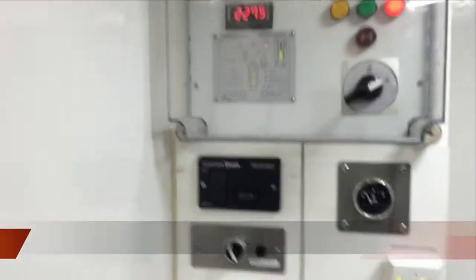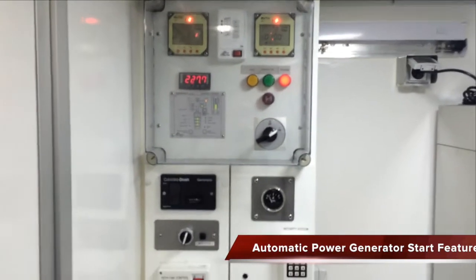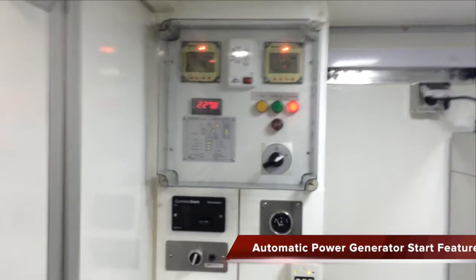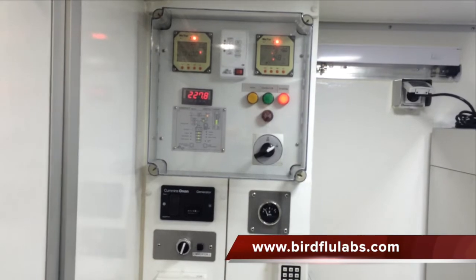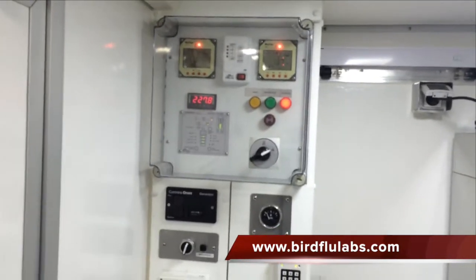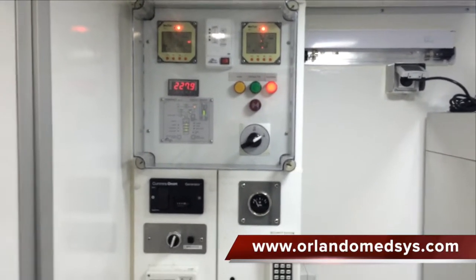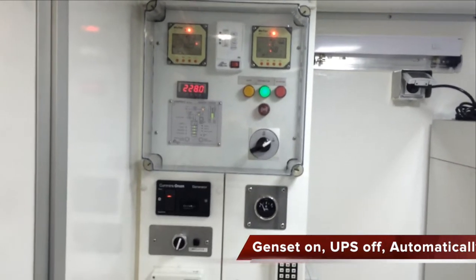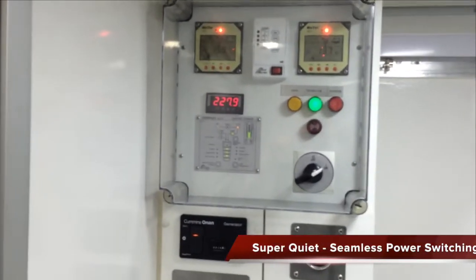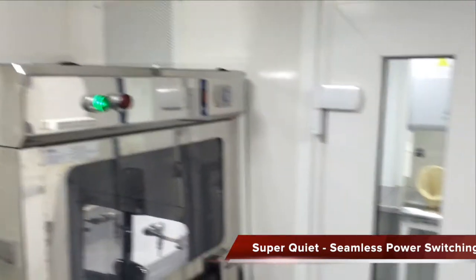Close the door behind me and I will start the generator automatically. I'll turn on the automatic start function for the generator. At this point the generator runs through a priming sequence, which takes just a matter of seconds, and the generator will start itself. You can now see the generator has taken over power inside the lab. The voltmeter is now telling us the voltage of the generator. We did not lose any functionality inside the lab.